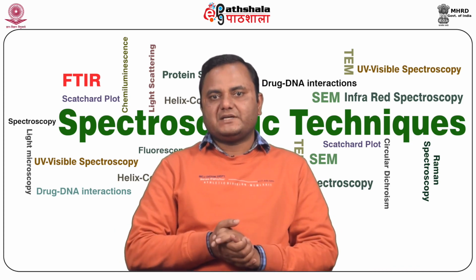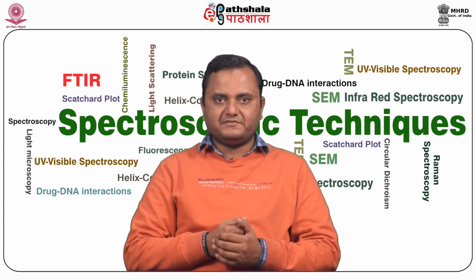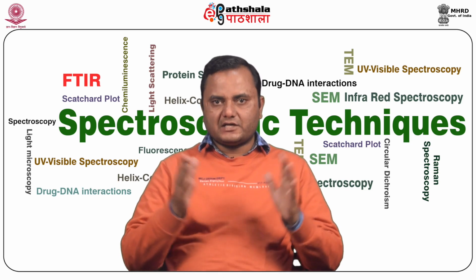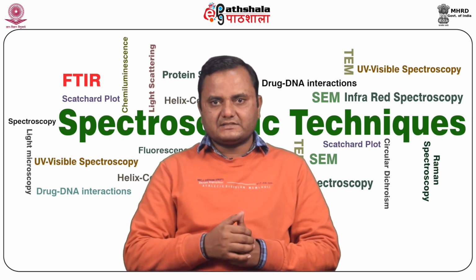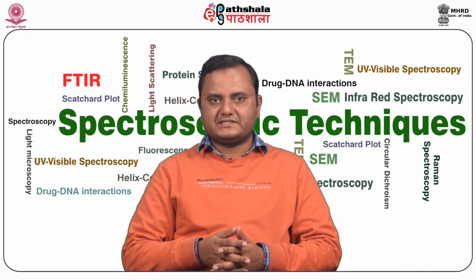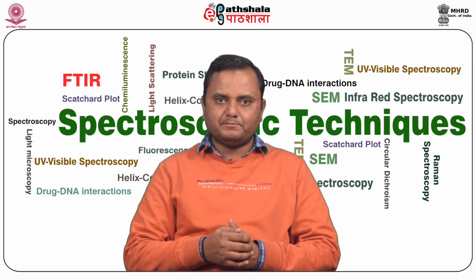ORD spectra are dispersive, called a Cotton effect for a single band, whereas CD spectra are absorptive. The two phenomena are related by the so-called Kronig-Kramers transforms. The maximum of the CD occurs at the absorption lambda max. Where there is more than one overlapping Cotton effect, the CD may be easier to interpret than the ORD with its overlapping S-shaped bands.